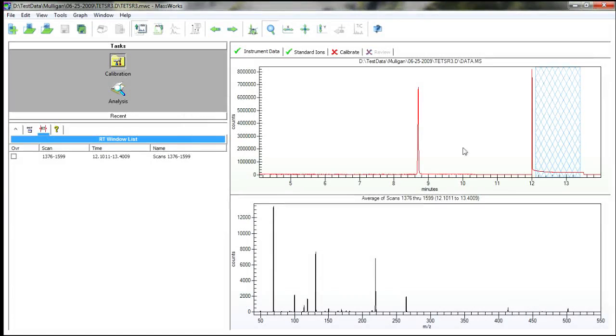Agilent GC MSD has the capability to program PFTBA calibration gas as part of a GC run. This conveniently enables a fresh, accurate mass calibration to be built for each and every GC run, even though the GC MSD system has been shown to be stable for at least 1 to 3 weeks at a time, provided that the MSD uses the same tune file.